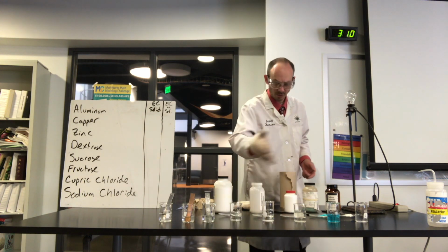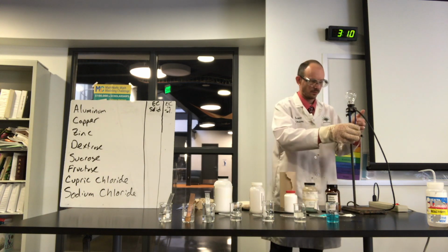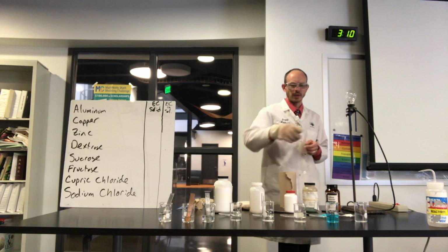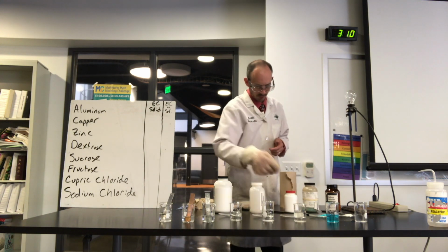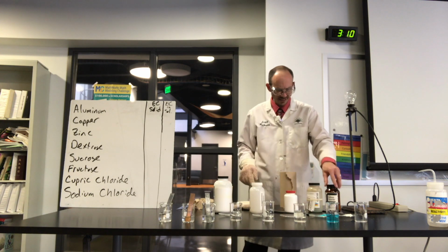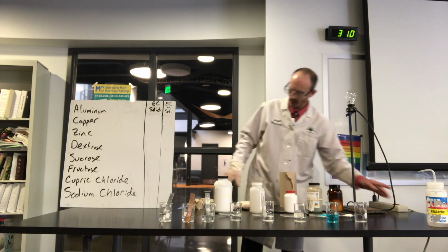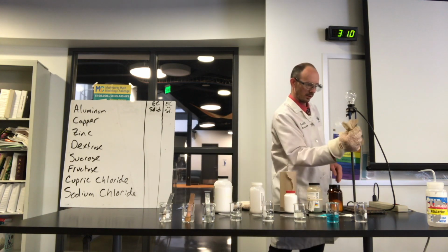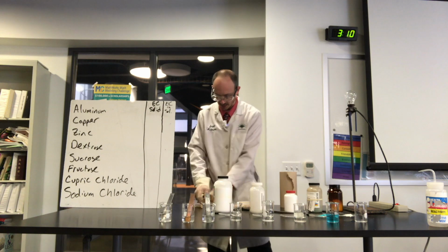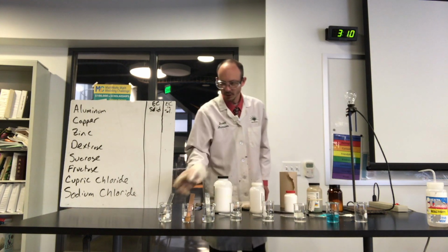Just to show you that I did one after another and that I haven't touched anything else. That was the salt again. So that means these 3, fructose, sucrose, and dextrose, didn't conduct while sodium chloride and copper chloride did in water. I'm going to turn it off, clean these electrodes. We got 3 more to go. Back on. It's working.